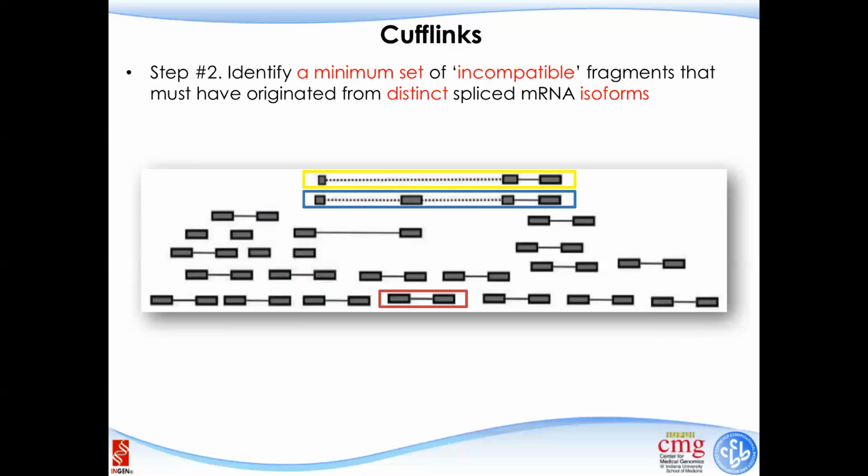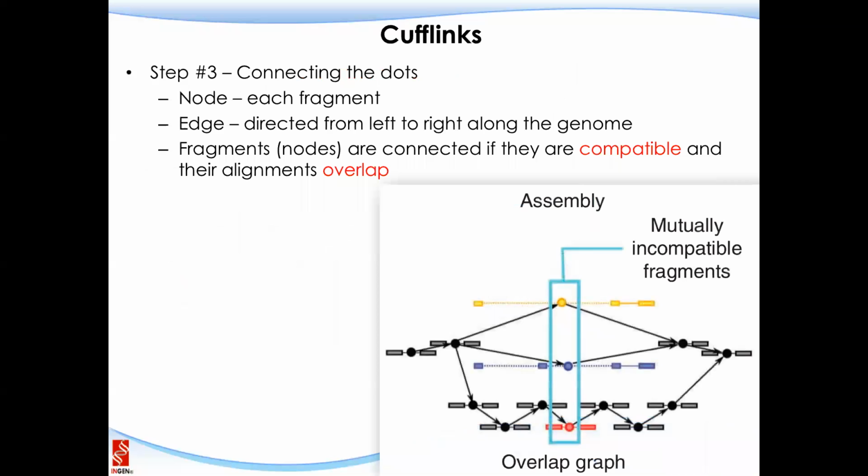And the purpose of this step is just to identify the reads that definitely are not from the same isoform, and then they may connect.